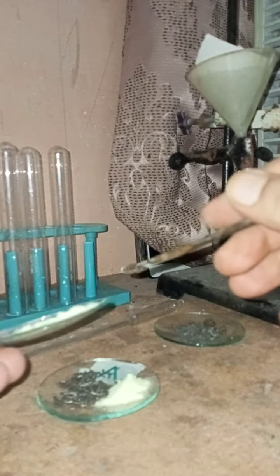I am going to add sulfur powder to it, and then I am going to add some of the iron fillings into the sulfur powder. So now you can see I have mixed both the substances well. So now we have the iron fillings as well as sulfur powder mixed with each other.